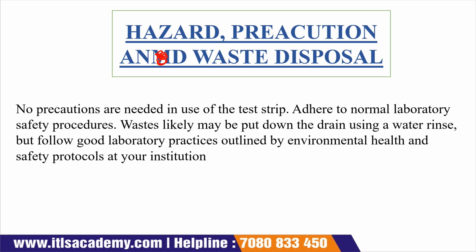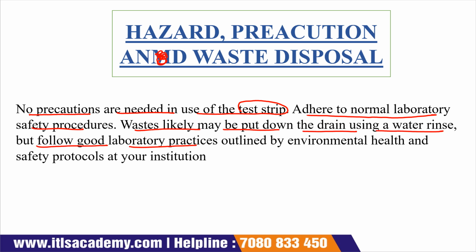Now see what is written in the slide. No precaution is needed in use of the test strip. Adhere to a normal laboratory safety procedure. Waste likely may be put down the drain using a water rinse, but follow good laboratory practices outlined by environmental health. When we drain out this waste with the help of the water rinse, we have to make sure that the environmental health should not be disturbed, and other safety protocols at your institute should be followed.